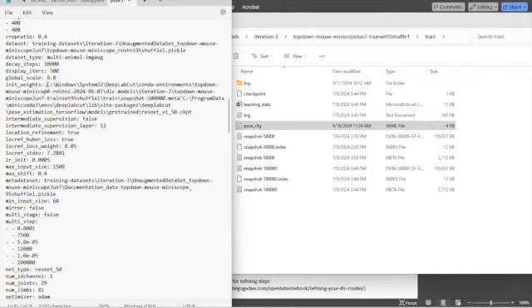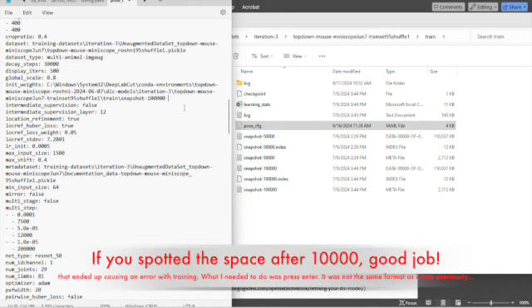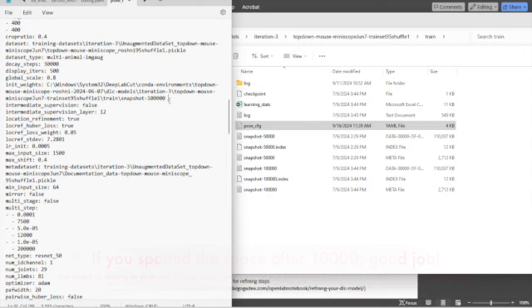So there's one space there, and then I deleted the quotation mark, and then I'm going to delete the dot meta and the old path. Okay, and then again, make sure that it's the exact same format as it was previously.